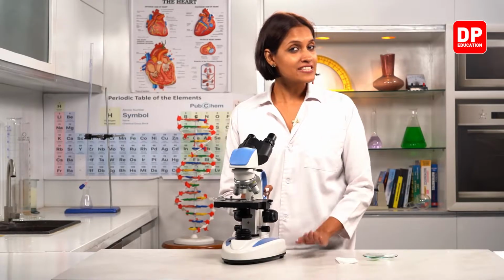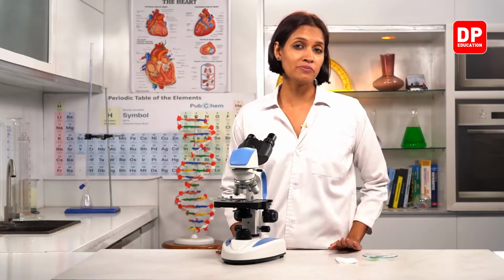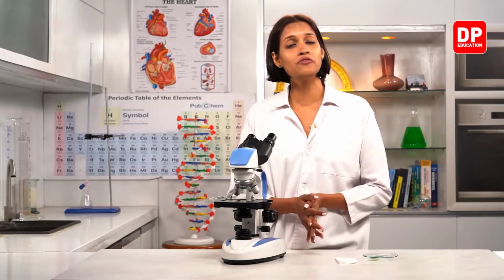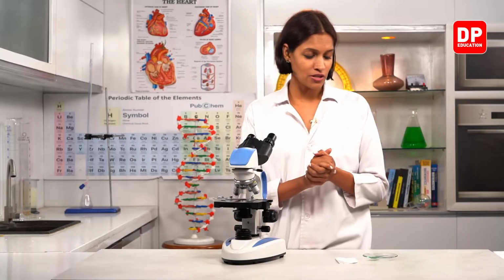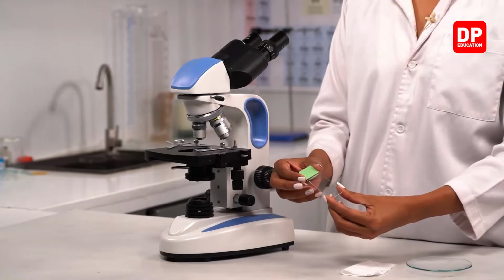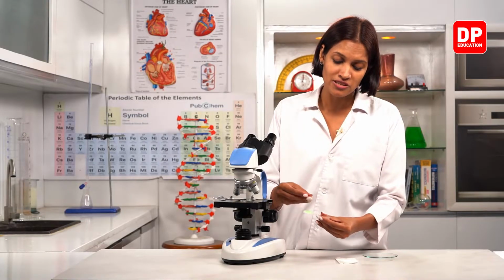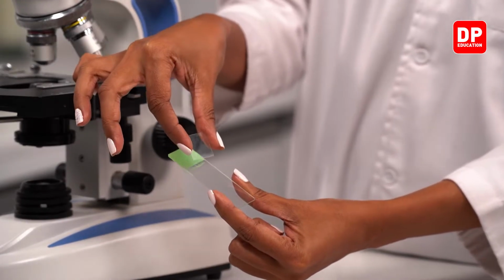Right, children? And the next thing is, children, you all know that we are going to observe different types of specimens under the microscope. Okay? So sometimes we need to make our own specimen. When we make our own specimen, we need to use slides and cover slips. Okay? So I'll show you. This is a glass slide. When we make a specimen, we have to place the specimen on the middle of the slide, and then we need to cover the specimen with a cover slip, this thin piece of transparent cover slip.